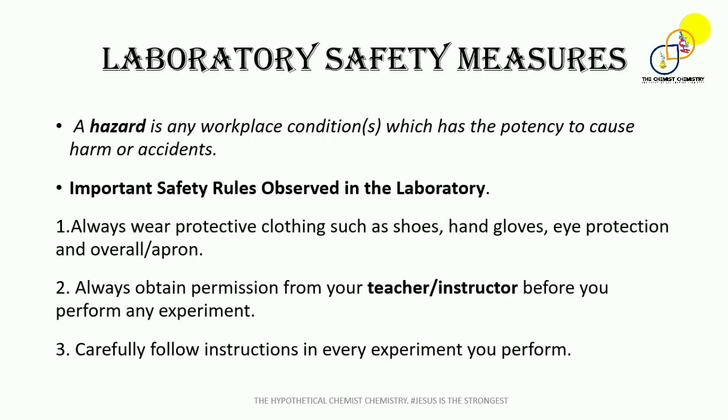Also, to my students, anytime that you find yourself in the laboratory, make sure you obtain permission from your teacher or your instructor before you perform any experiment. Never try to start any experiment on your own. Thirdly, strictly follow instructions in every experiment that you perform. Every experiment has its own instructions, and make sure you go strictly by those instructions.